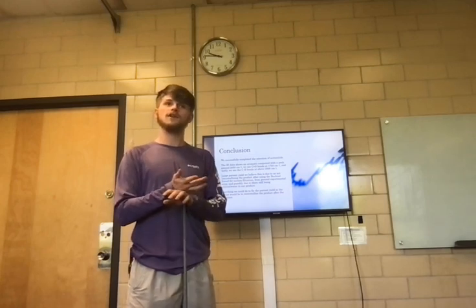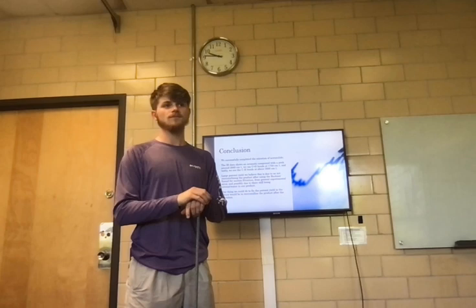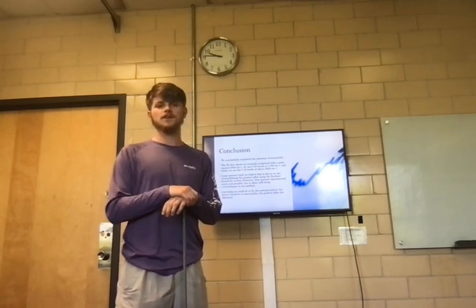So who knows what could be left in there? Who knows what was in there? Who knows what it would have been had we recrystallized? So if we were to do it again in the future, we would make sure to recrystallize.